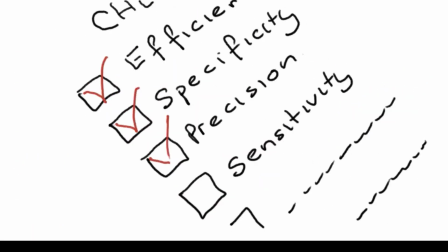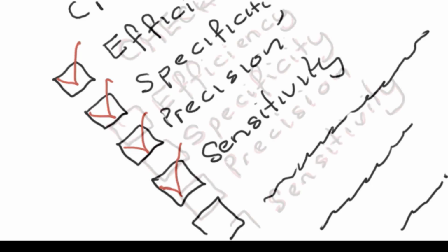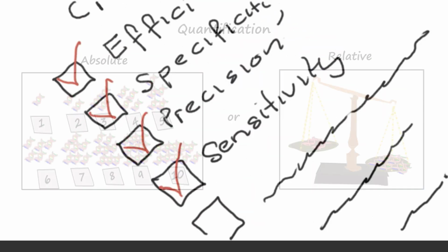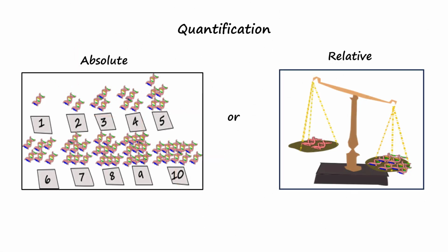Once the PCR assay is validated and it is confirmed that the fluorescence measured is due to the gene of interest, the next step may be to quantify the initial concentration of the locus of interest. Depending on the experimental question, quantification may be absolute, in reference to an appropriate standard curve, or relative, a comparison between samples.